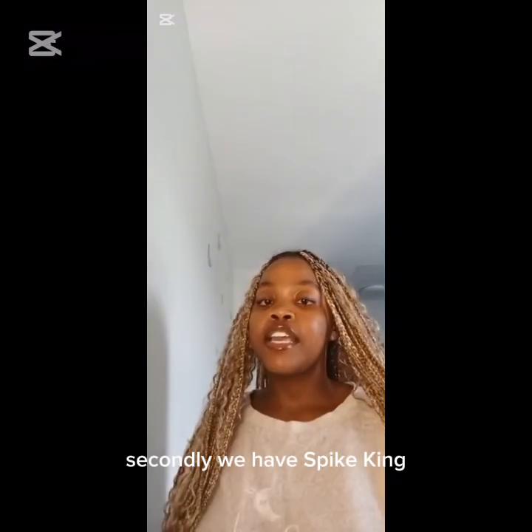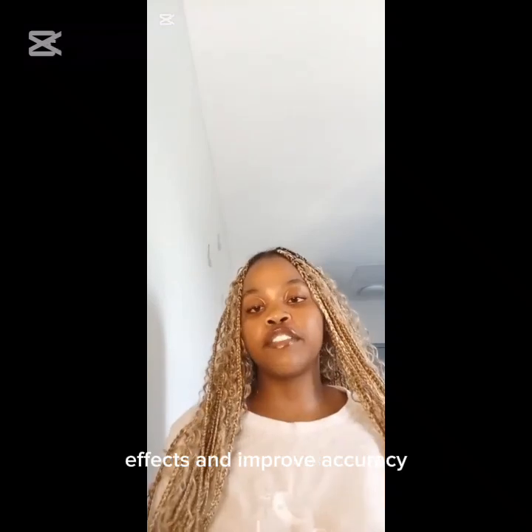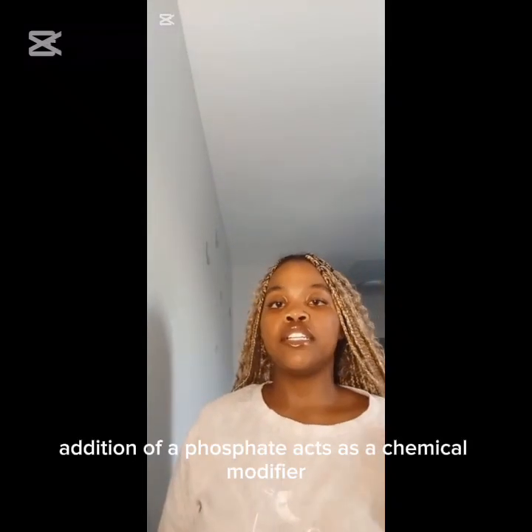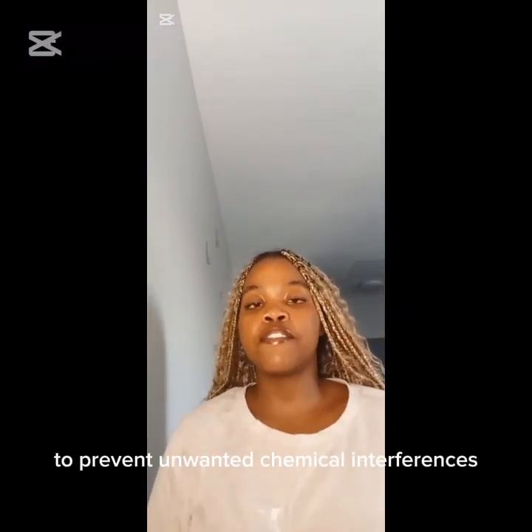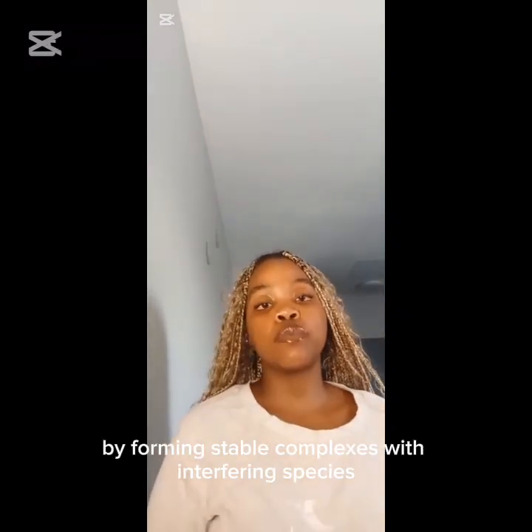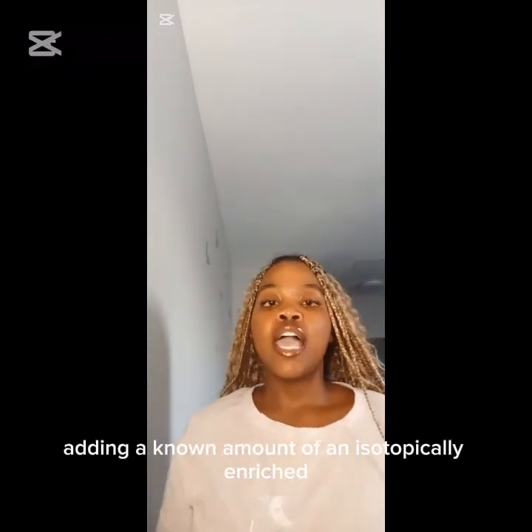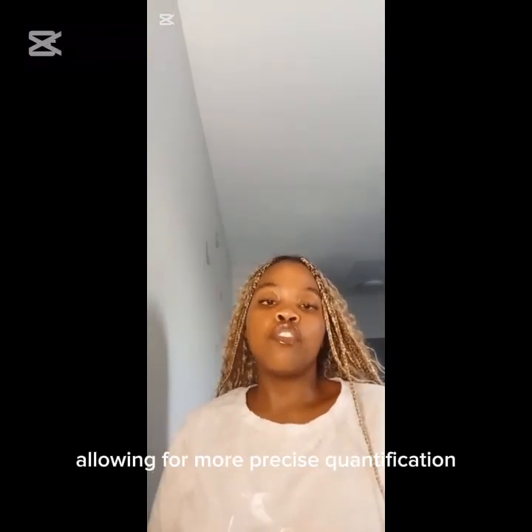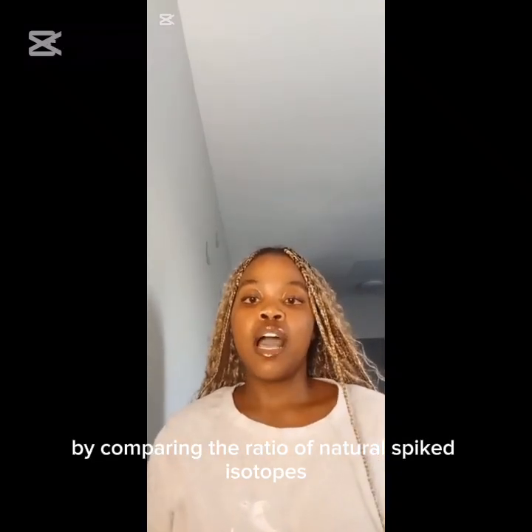Secondly, we have spiking. It involves adding a known amount of analyte to the sample to compensate for matrix effects and improve accuracy. And now we have adding phosphate. Addition of a phosphate acts as a chemical modifier to prevent unwanted chemical interferences by forming stable complexes with interfering species. Isotope dilution, which is the last one, involves adding a known amount of an isotopically enriched version of the analyte, allowing for more precise quantification by comparing the ratio of natural to spiked isotopes.